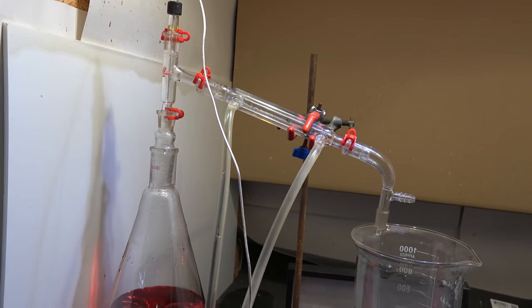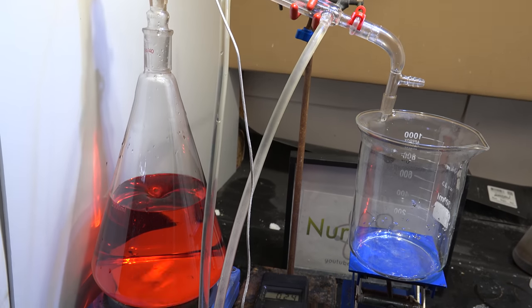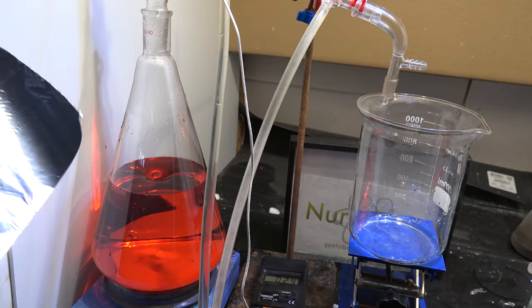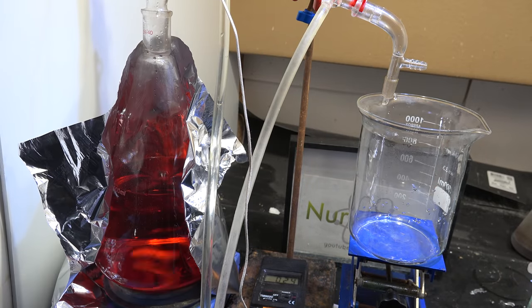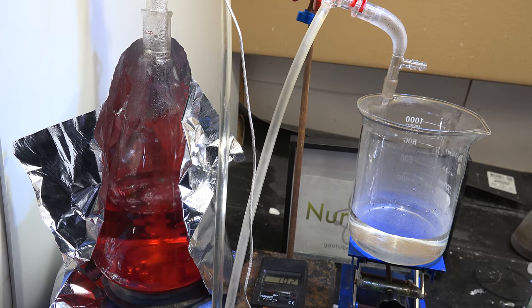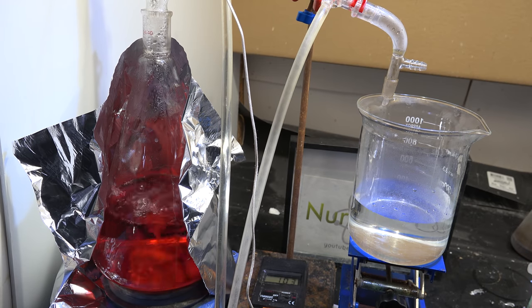Now we need to purify our propylene glycol. So we set up a simple distillation apparatus. I'm going to put on this foil shroud to keep the heat in. Now we just turn on the heating and start distilling. My antifreeze was pre-mixed with water so that's going to distill off first.